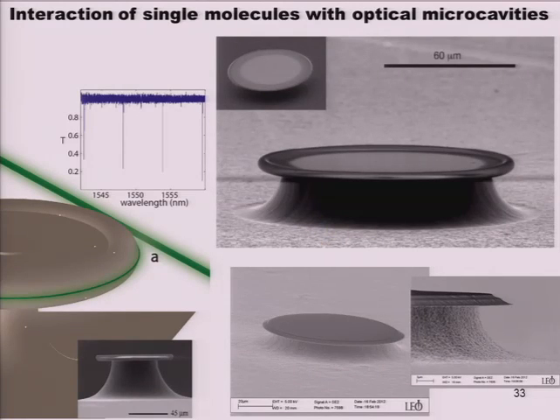We're also doing something that has nothing to do with fluorescence at all. We're interested in developing ultra-high Q optical microcavities as a means to measure dynamics of single molecules. This is what we're trying to make. This is the work from Kerry Vahala's group at Caltech. This is where we've gotten. So we're actually pretty close. The critical step that's missing to go from structures that are rough like this to structures that are smooth like this is a CO2 laser-induced reflow step. According to FedEx tracking, our CO2 laser arrived earlier this morning, which is really exciting. So hopefully we're not too far away from that.